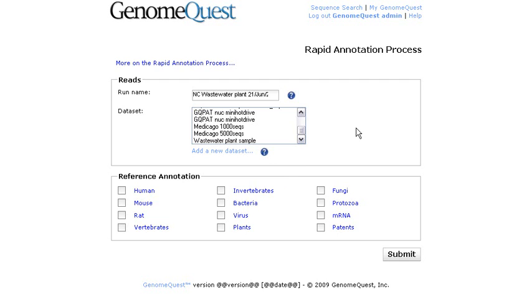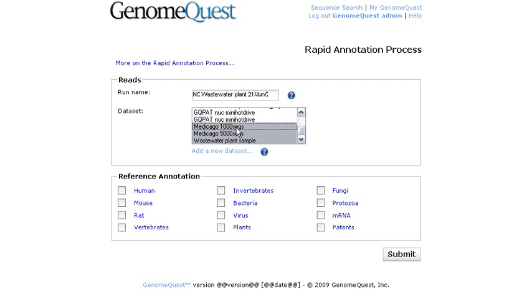So now let's get back to the submit page. As you can see on the rapid annotation process submit page, you just need to type a meaningful run name. Then choose what are the sets that you want to analyze. For example, wastewater and I could select some others with control. In this case, I just want to use the wastewater plant sample for the analysis.